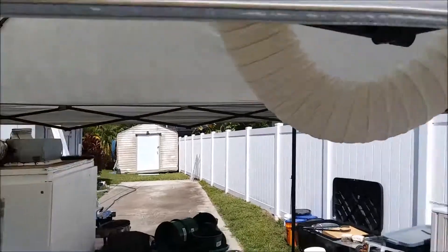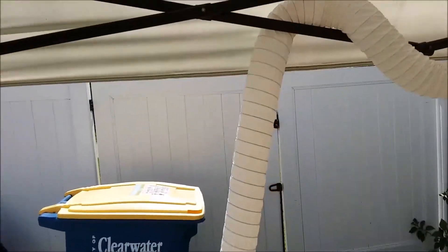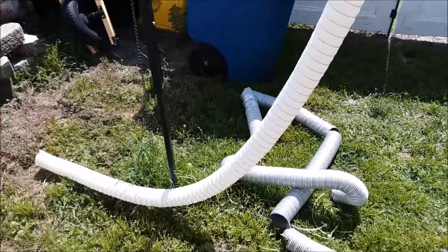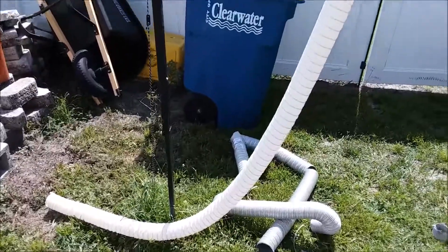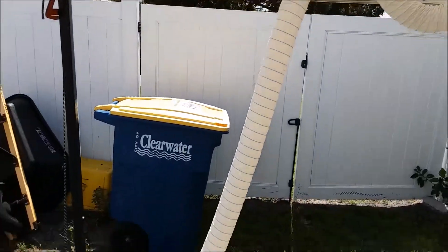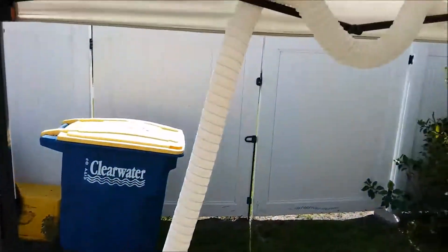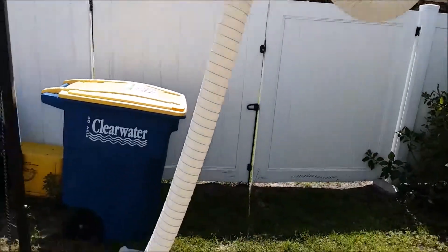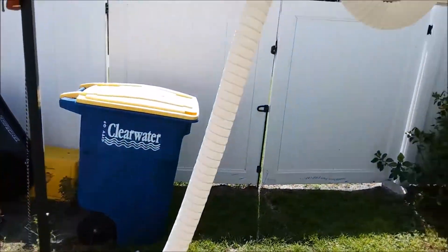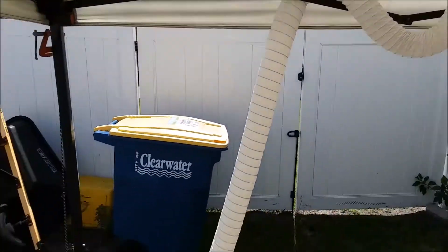It's PVC flex duct. I haven't quite decided how I'm going to run it yet. I don't know if I'm going to run it up and make a stack above like I did before, because sometimes depending on how the wind blew I would still get a little whiff of this stuff. Most of the gases I'm generating are heavier than air, so maybe I should just run it down into the corner of the yard and let it dissipate at ground level. Maybe I'll try that and see how it goes.